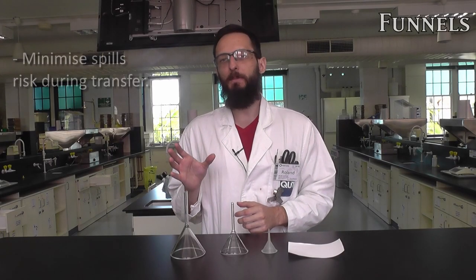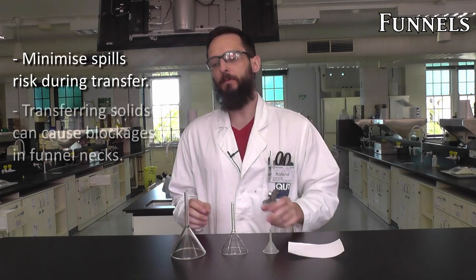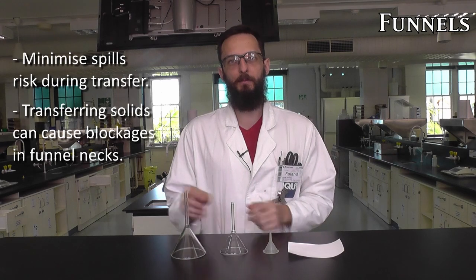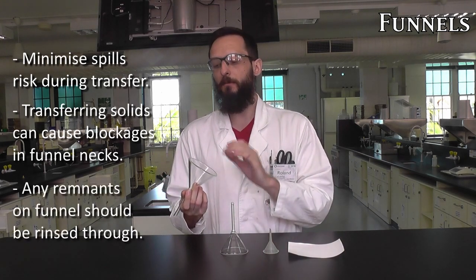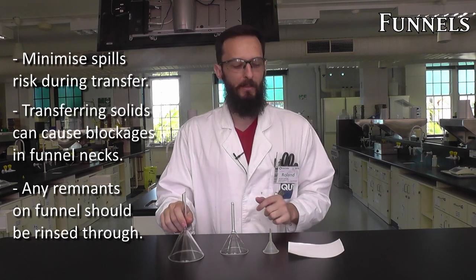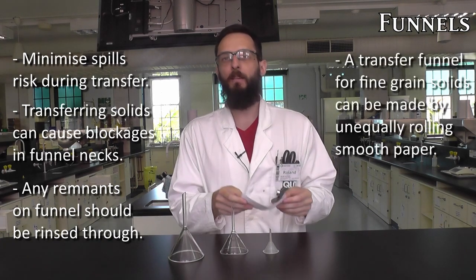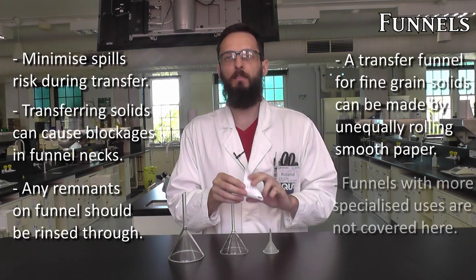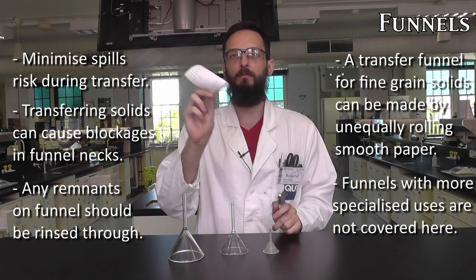There are two main types of funnel you'll find in the laboratory. The first is the glass funnel, and the second the plastic. The main difference between them is really only the size of the neck. You can use the glass funnels to transfer solids, but unless the funnel and the solids are both incredibly dry, you risk blocking up the neck. What we can use instead is a simple piece of scrap paper, which you can find at the front of the lab, and if you just curl it like this, you can make a funnel with a large entry and a small exit.